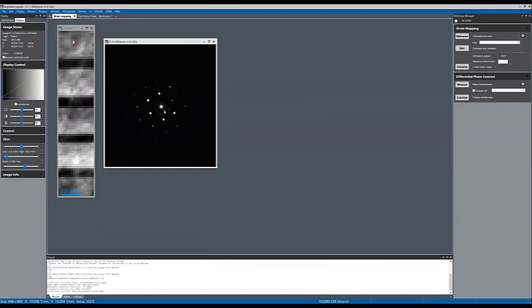So there are a couple of things to consider. First of all, you don't want to blindly do this SI alignment and take it out, because that movement might be from the sample. The second thing is you want to make sure that you are not taking microscope effects into your analysis.